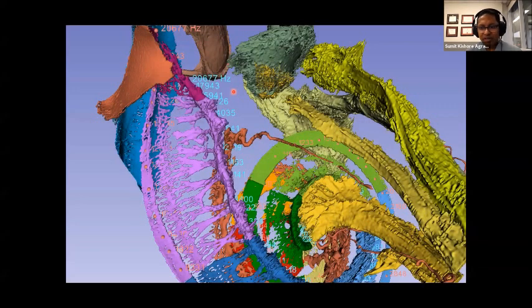The second thing I want to point out on synchrotron, if we zoom in, is that here's the organ of Corti again. Here's the spiral ganglion, and here's the dendrites connecting the two. We can see that there's bundling of the dendrites. So this whole region of frequencies all bundle together and connect to one spot on the spiral ganglion. So there's actually this bundling, and this will come into play when we do our mathematical modeling.